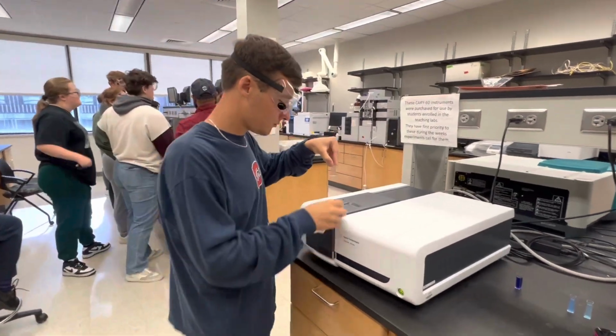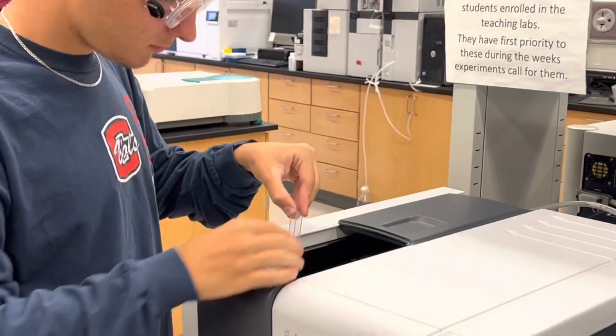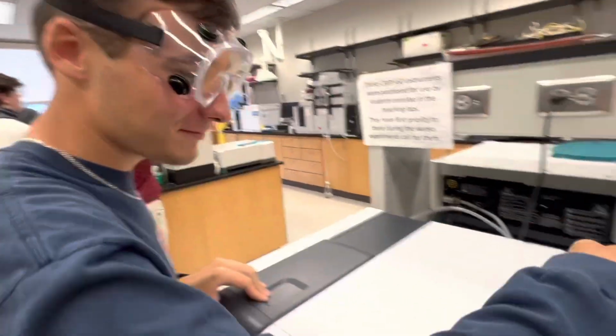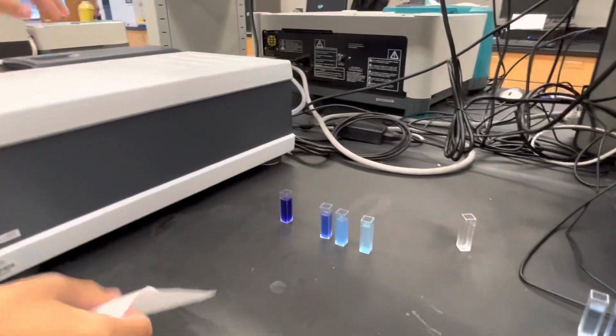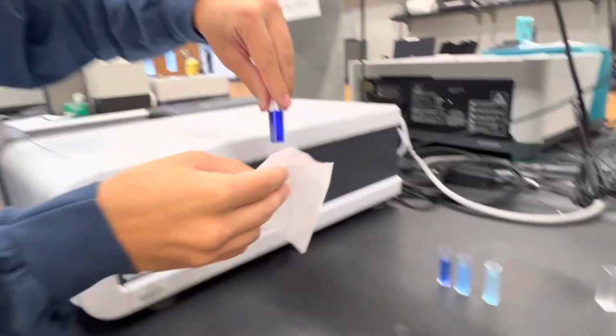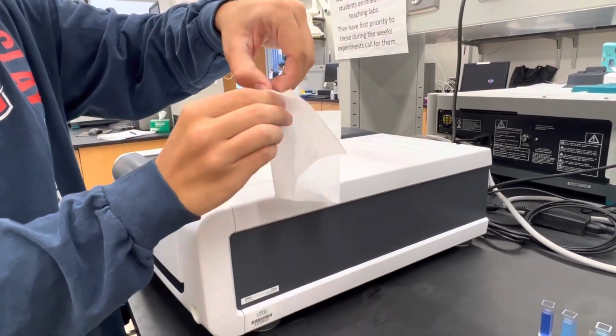Okay, so in this lab video, you're going to see Thomas, Maggie, and Jada doing the different dilutions and wiping the sides of the cuvette. Thomas is doing that right now.